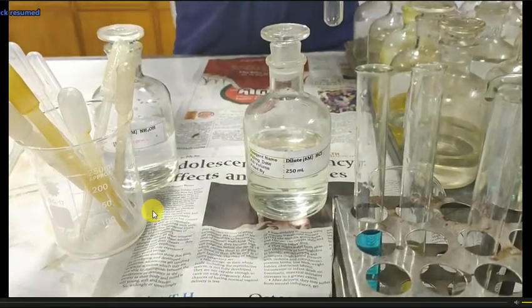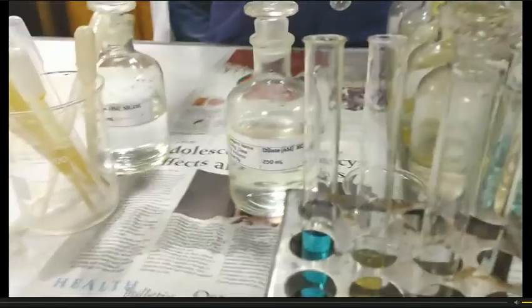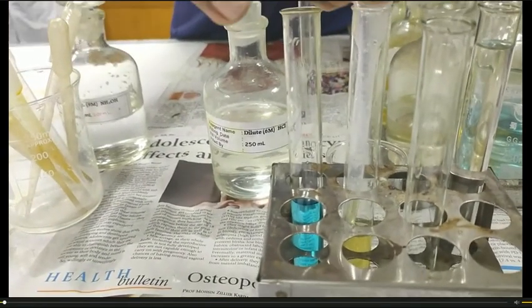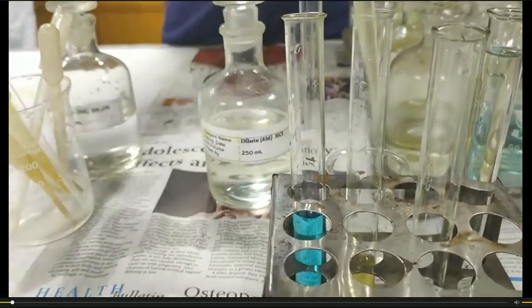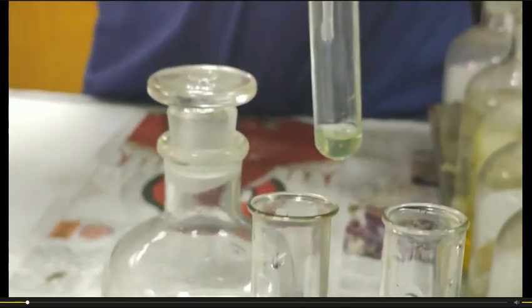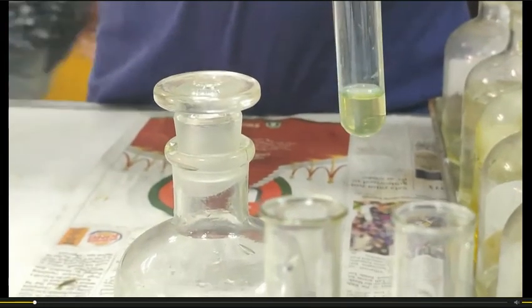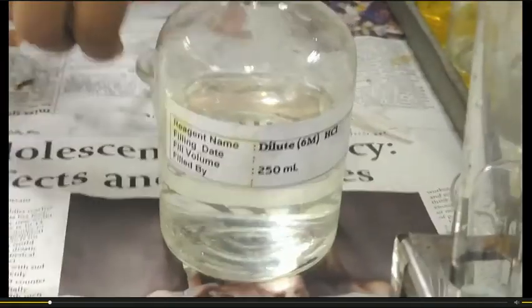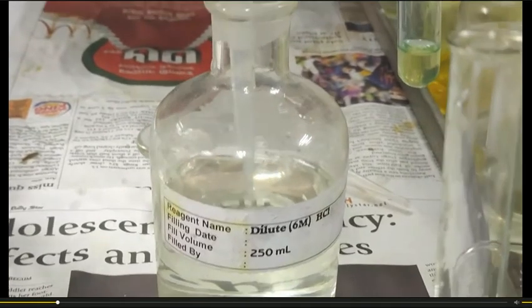We are going to test for the presence of group 3 cations. At first we would take the sample solution in the test tube. Into the sample solution we would add dilute hydrochloric acid. We are taking the sample solution in the test tube. Now into this sample solution we will add dilute, that means 6 molar, hydrochloric acid.